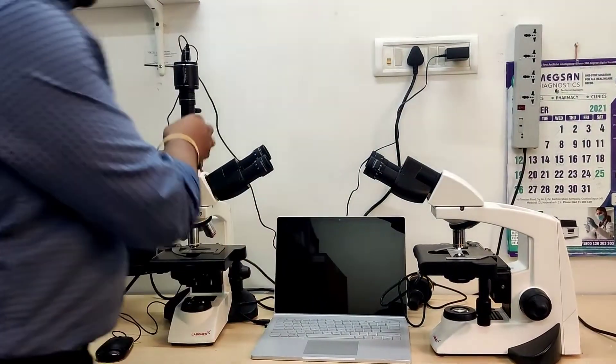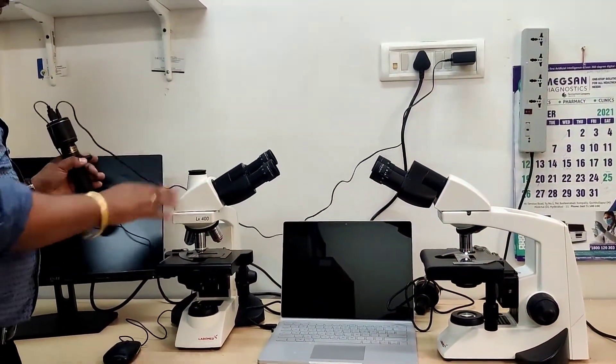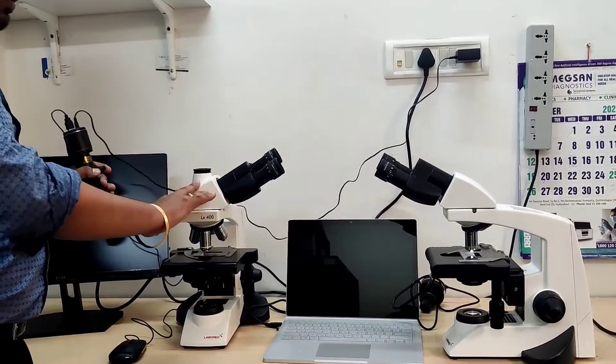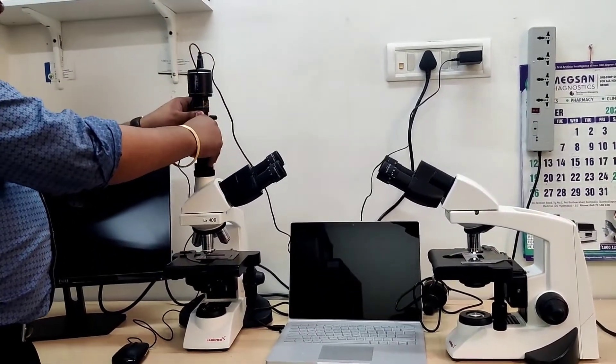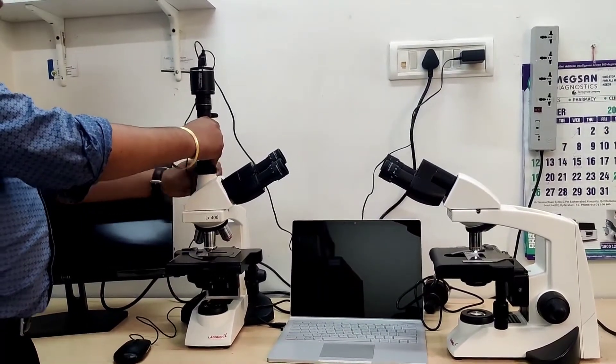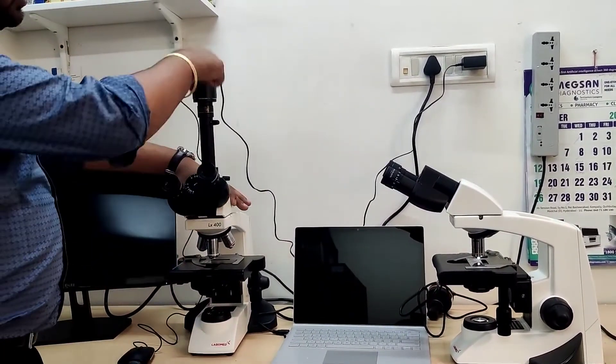Whereas in this model you get a third port. So this is a Trinocular model. In this you can attach a camera in the future. You can place the camera over here and fix the camera.